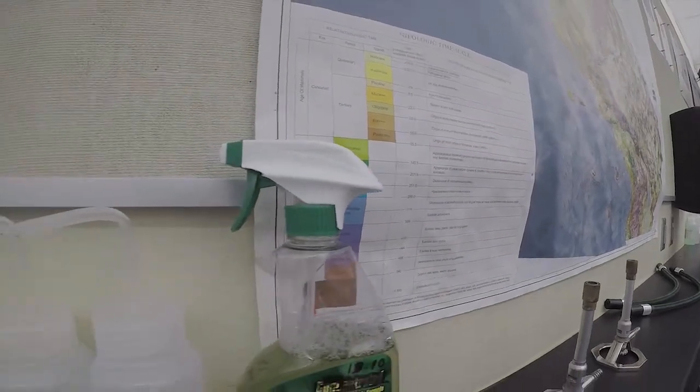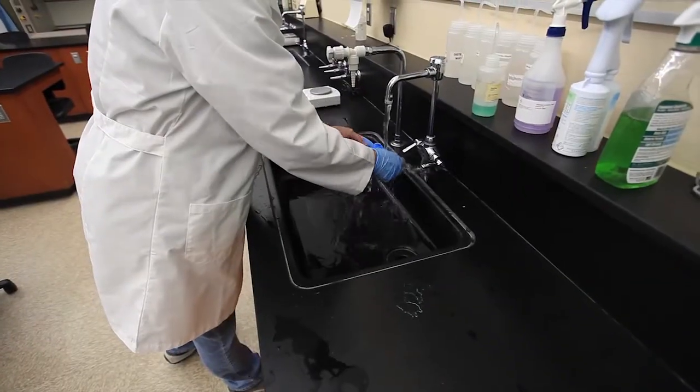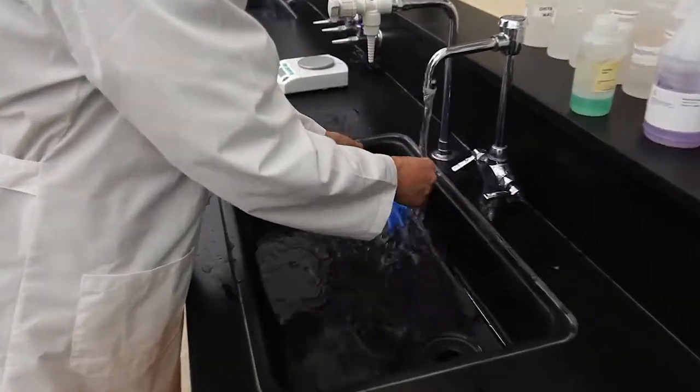To prevent a transfer of chemical residue in unwanted places, remember to not touch your face, skin, phone, backpacks, doors, or any other public spaces while you have your gloves on. Remembering to remove your gloves before you exit the lab will help in achieving this goal. And always, always clean your area and wash your hands thoroughly when finished with your lab.